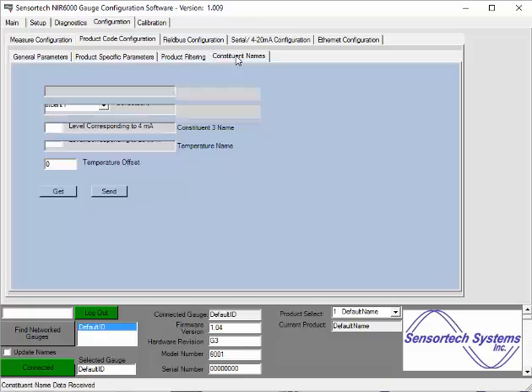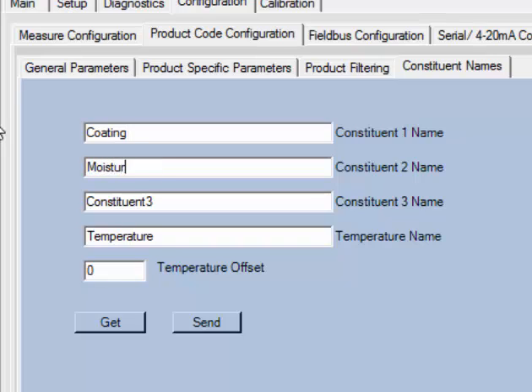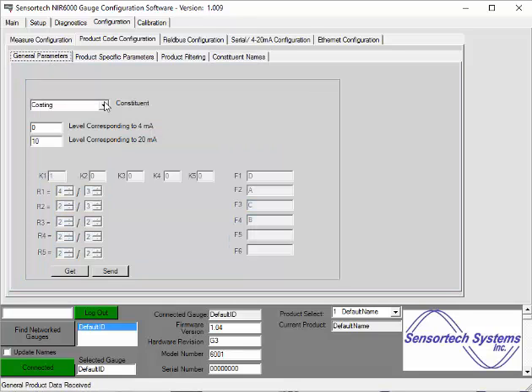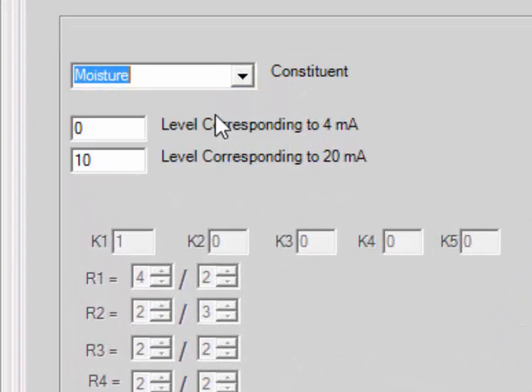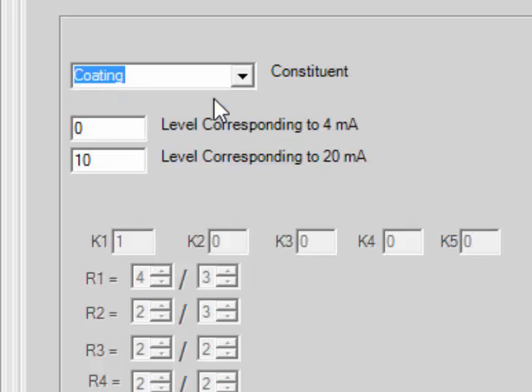Selecting between Constituent 1 and Constituent 2 will change between the factory settings for each of the constituents. You can edit the constituent names in the Constituent Names tab by changing the text and selecting the Send button. Note that these names are generally set at the factory and you will receive the analyzer with the names already in place, although you do have the option to change these names as desired. The constituent names will be changed and this will be reflected in the Constituent drop-down menu back in the General Parameters tab. The factory set R1 ratio is set for each constituent and you will see the change when switching between Coating and Moisture.